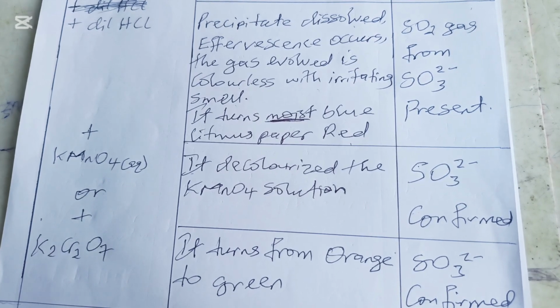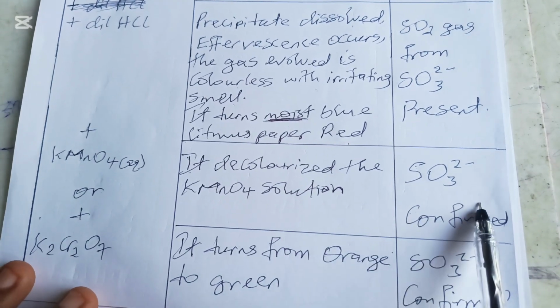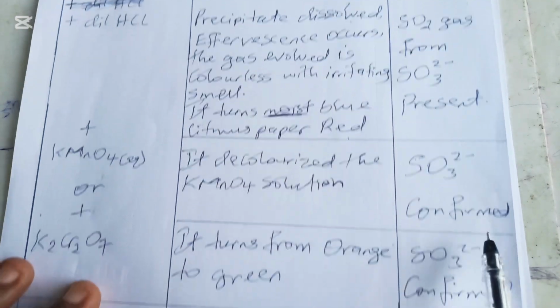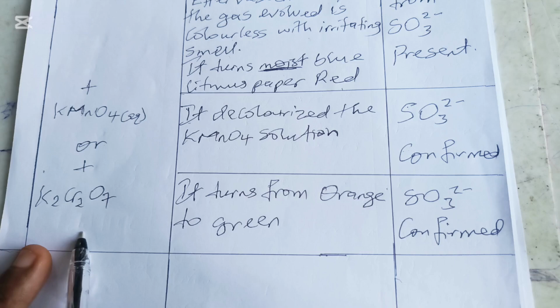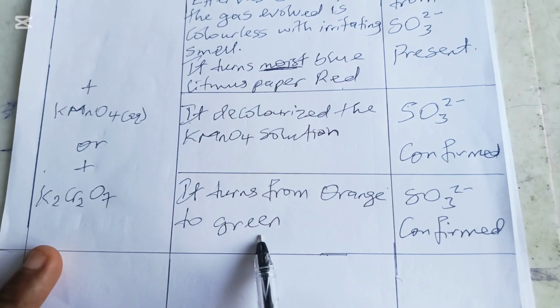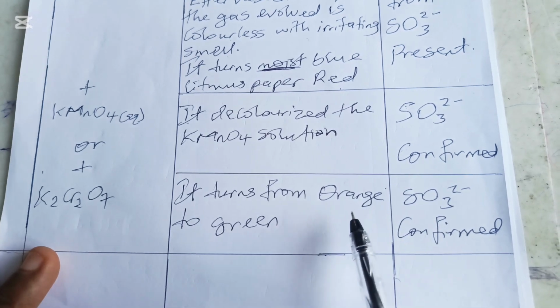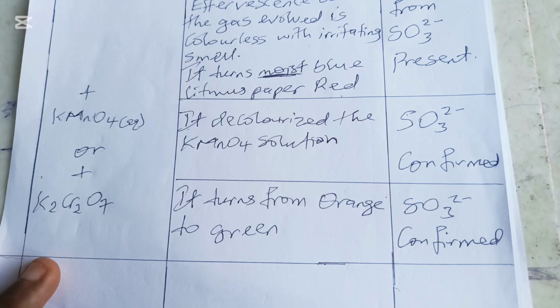When it turns from purple to colorless, SO3 2 minus is now confirmed because you have suspected it earlier. Now, they might tell you also to use K2Cr2O7 inside this. It turns from orange to green. SO3 2 minus confirmed.